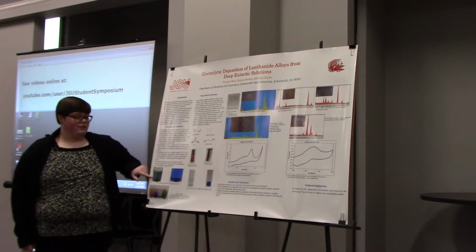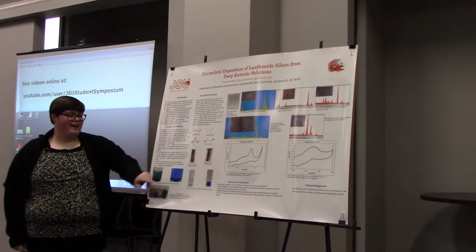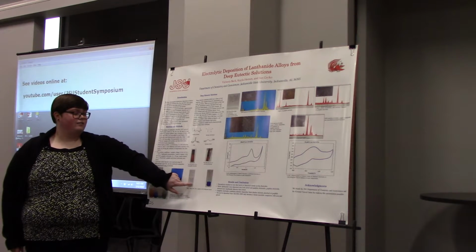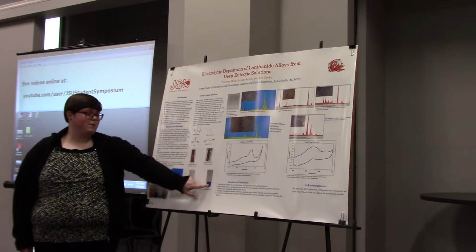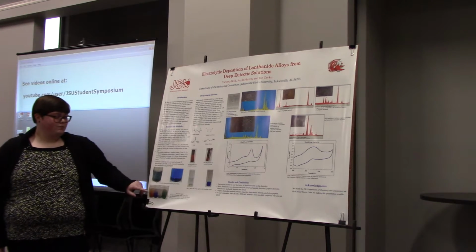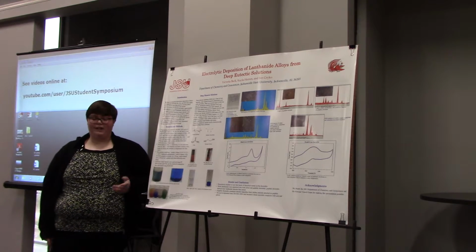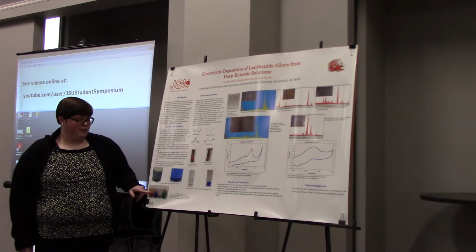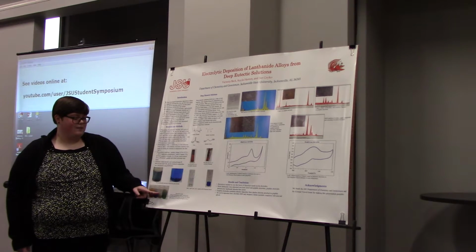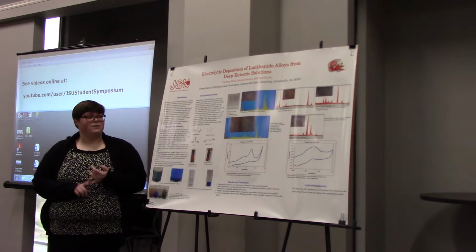So this is nickel electrolytically dissolved in choline chloride and urea, and choline chloride and malonic acid. This is neodymium chloride and choline chloride and ethylene glycol, and this is cobalt 2 chloride and choline chloride and ethylene glycol. For the 4 down here, the solvent was, again, choline chloride and ethylene glycol. This is copper 2 chloride, this is cobalt 2 chloride hexahydrate, this is neodymium chloride and samarium chloride, and this one is copper, cobalt, neodymium, and samarium.